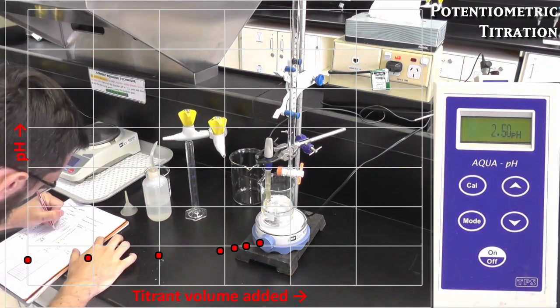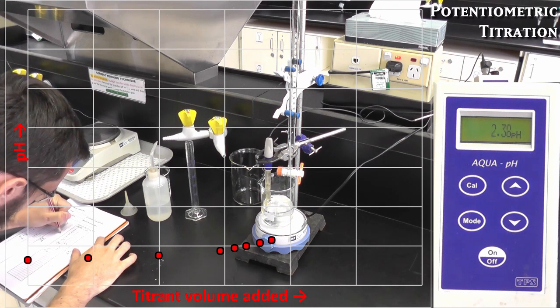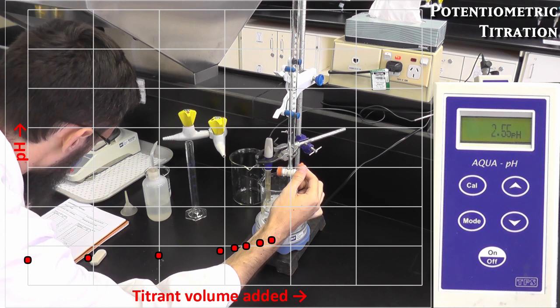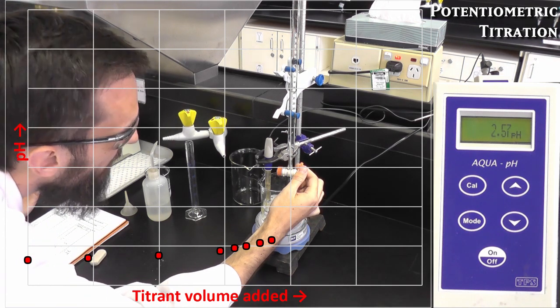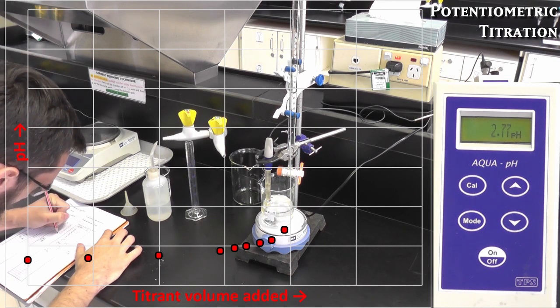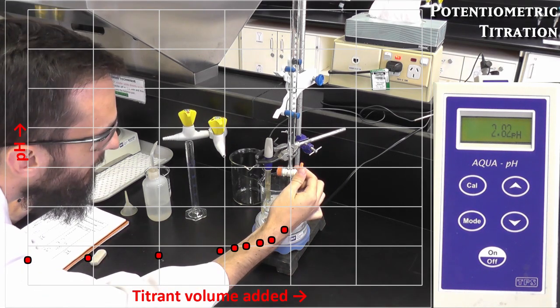Keep an eye on the data for when these smaller additions have a larger change in the pH, resulting in a steeper slope. You likely won't be plotting the data as you collect it, so what you're looking for is a larger change in pH relative to the volume additions. And there it is. The slope increased significantly.